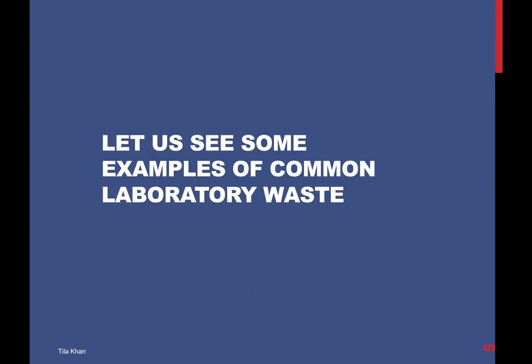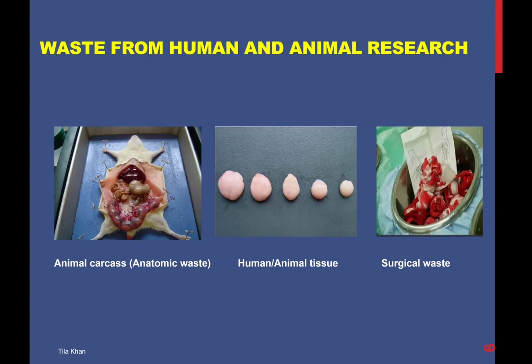Now let us see some examples of common laboratory waste. Most important is waste from human and animal origin, such as anatomic waste or pathological waste such as tissues and surgical waste. Please remember, infections can be acquired from all of these wastes.